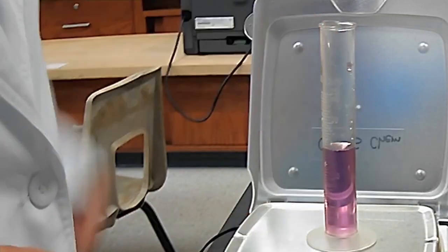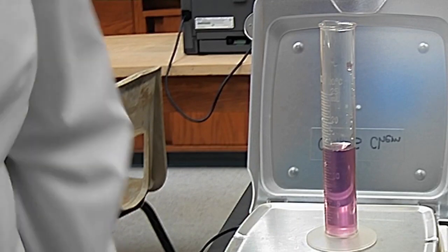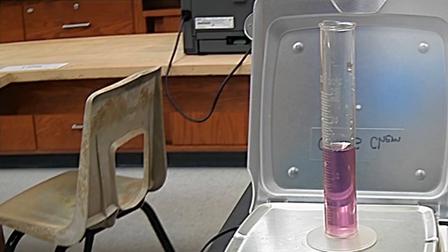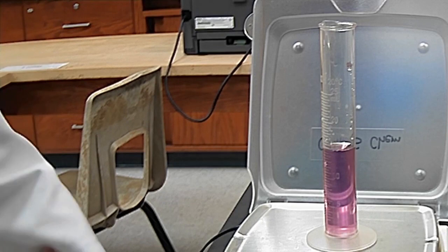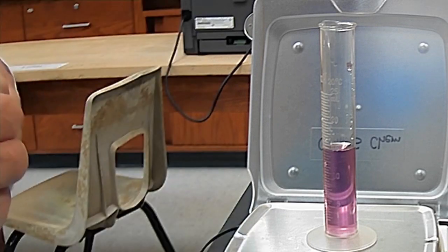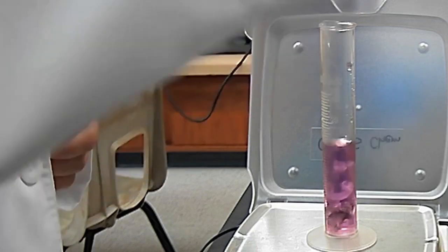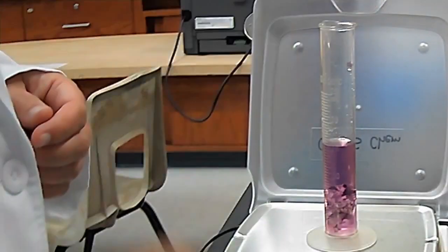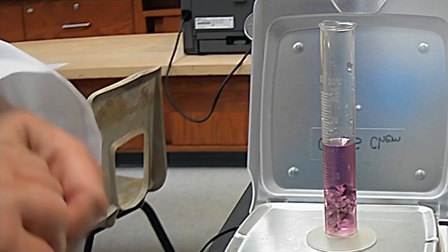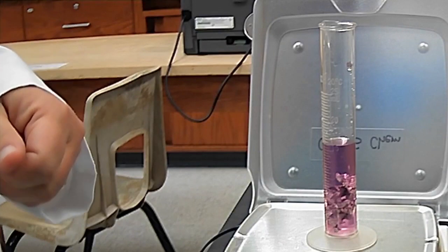And we're going to start with, this is metal B trial 3, 25.7 grams. So our third one is 25.7. This is trial 3 for metal B, 25.7. Okay, now, the beginning volume is 15 milliliters. So now let's add our, boy, I made kind of a mess there, huh? Okay, now I'm going to add our sample.